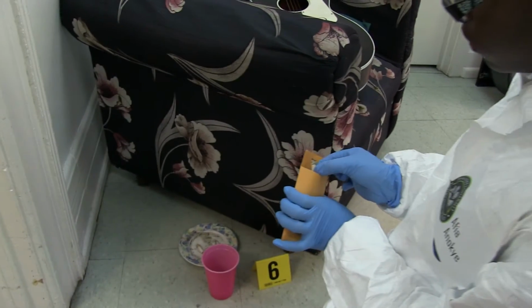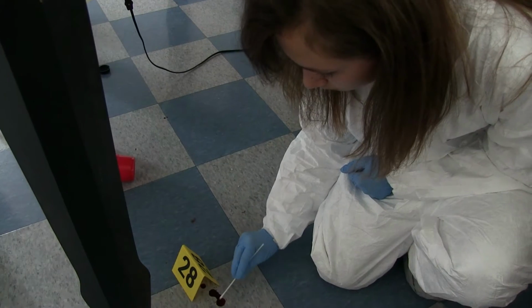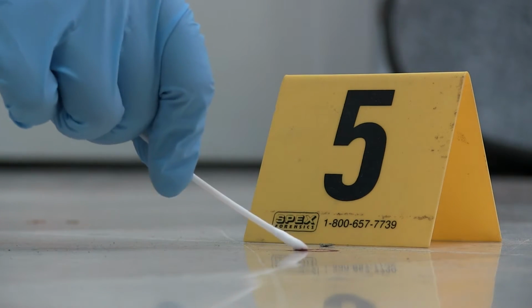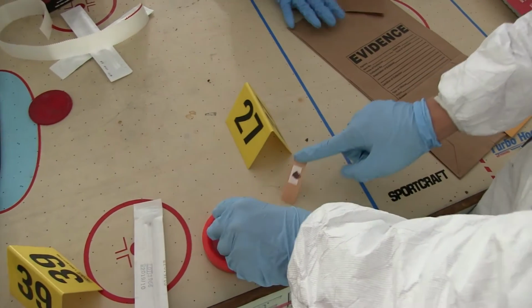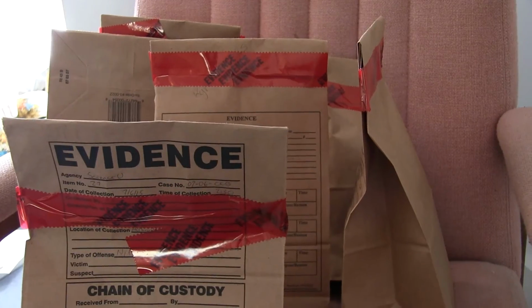We had them collect evidence at the crime scene cottage. So we want to give them a taste of the reality of how long it actually takes to process this type of evidence, because sometimes on television and some of the crime shows, they don't show how involved it really is. And we want to show them that you have to have a certain amount of patience, you have to be somewhat diligent in your note-taking, and it's an opportunity to bring them in and let them do the real thing with real equipment. Kind of when your expectation is that you can go into a crime scene in heels and pencil skirts and find all this information and just easily solve the crime. And so it's a lot different than what you see on TV, because you don't really see much of the science behind it and how much work they actually do towards solving what it is.